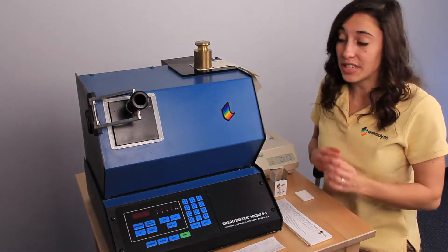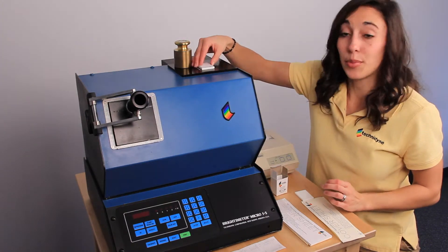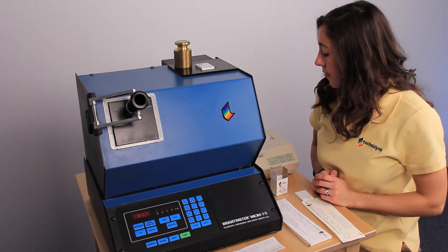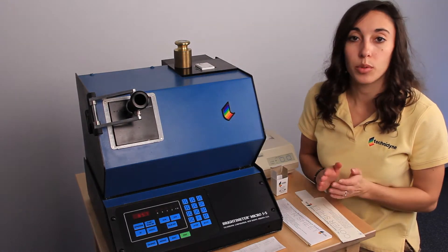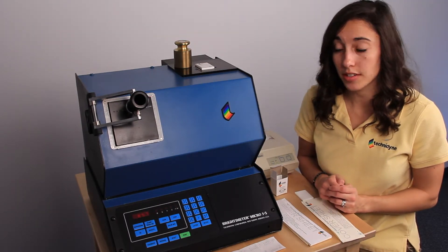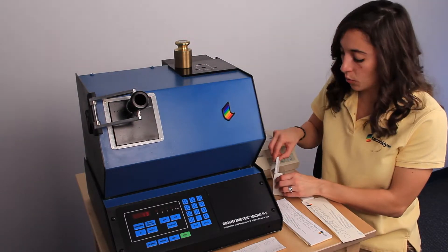Next, we're going to load our opal standard and press scan. It's going to ask us if the value that it gives us is within plus or minus 0.2 of the value on the standard. If it's not, you'll need to refer to your operator's manual for further instructions. Ours is within plus or minus 0.2, so I'm going to press 1 for yes.